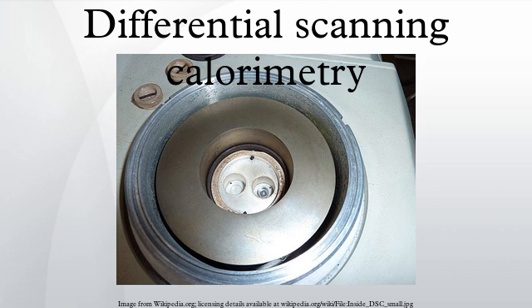The technique was developed by E. S. Watson and M. J. O'Neill in 1962, and introduced commercially at the 1963 Pittsburgh Conference on Analytical Chemistry and Applied Spectroscopy. The first adiabatic differential scanning calorimeter that could be used in biochemistry was developed by P. L. Privalov and D. R. Monaselidze in 1964. The term DSC was coined to describe this instrument, which measures energy directly and allows precise measurements of heat capacity.